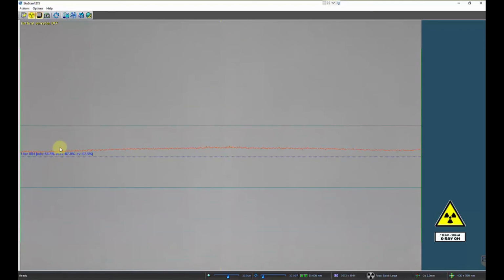So now that we have this all set, we didn't need to adjust our transmission in this case, and for most scanning, unless you're changing the power settings, you probably won't have to adjust it very often because the factory defaults are going to be there to begin with and get you pretty close.